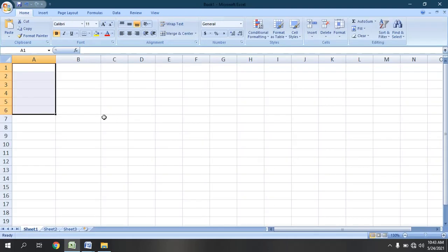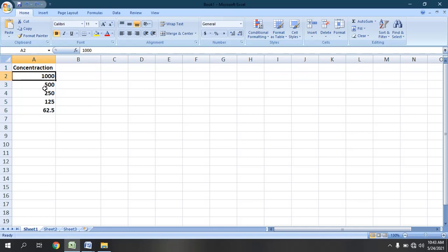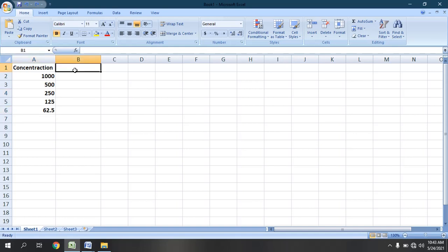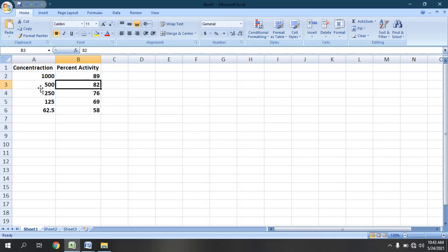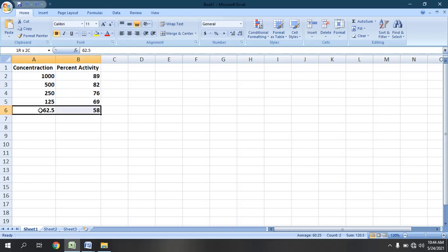First of all we will open the Excel sheet. We will put the concentration — for example, we have concentrations of 1000 ppm, 500 ppm, 250 ppm, 125 and 62.5 ppm. We have the percent activity: on 1000 ppm it shows 89%, on 500 ppm it shows 82%, and on the very lowest concentration of 62.5 ppm it shows 58% activity.